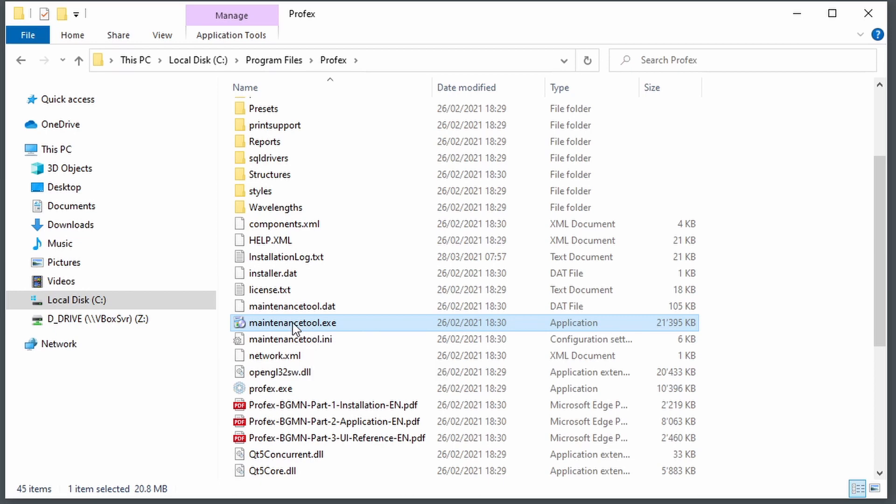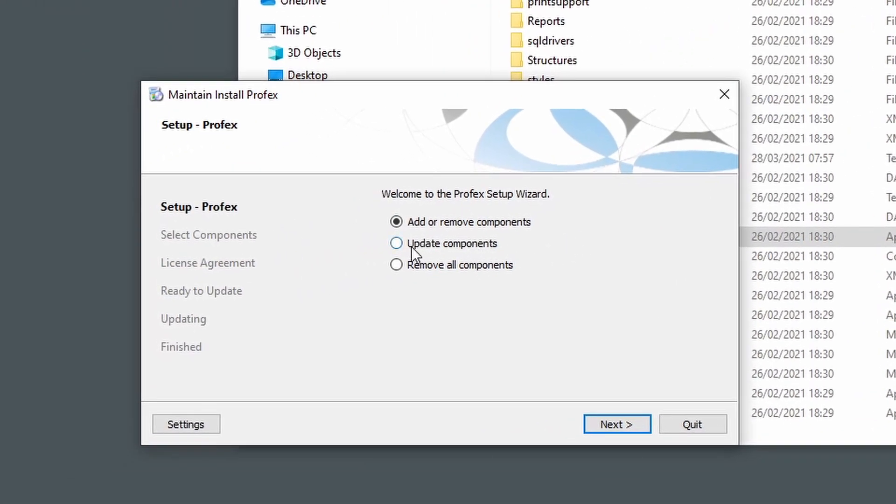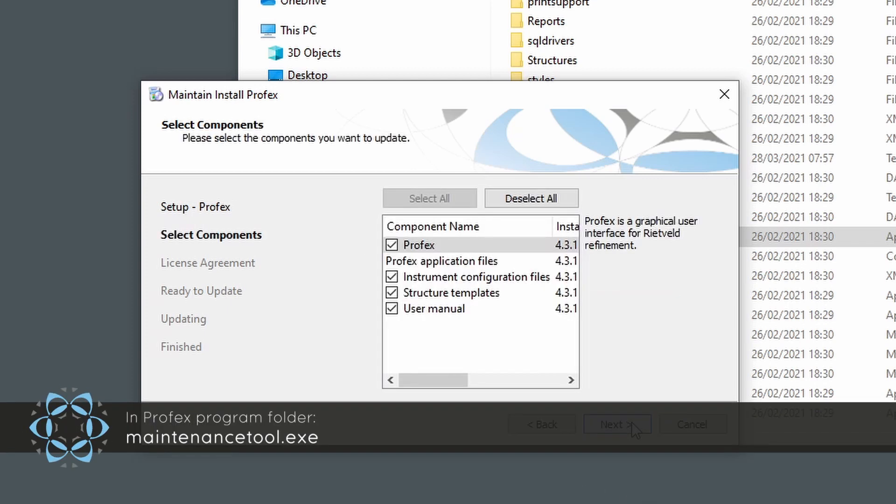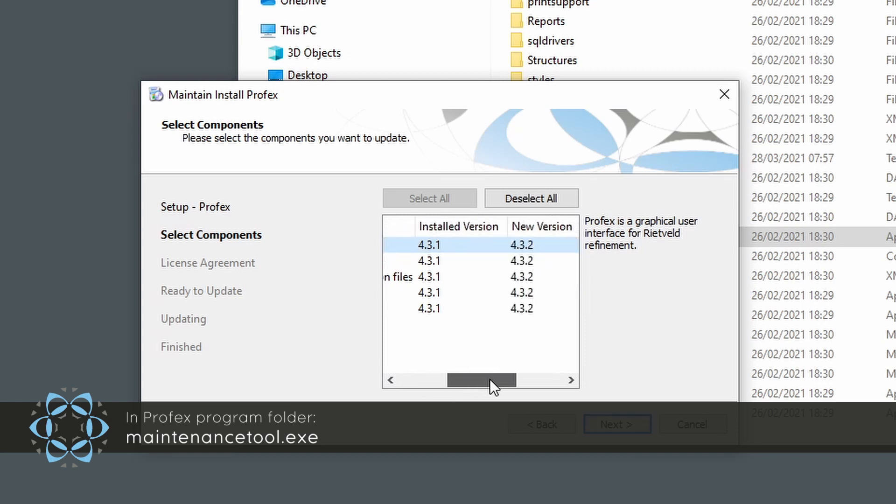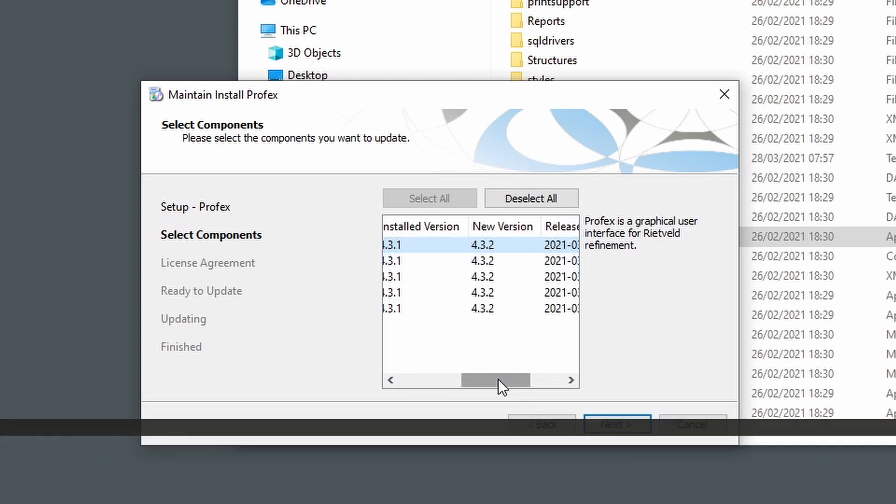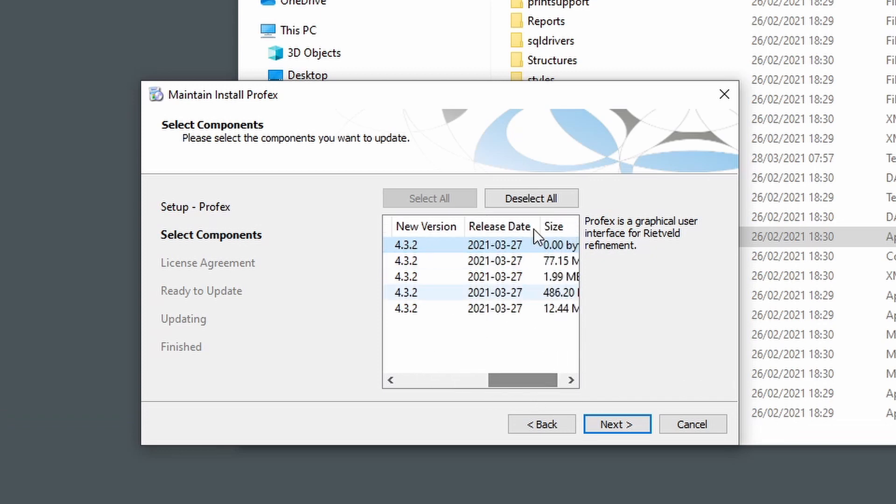We can run it, and then select the option Update Components, click Next, and now it will show us all the components for which a new version is available online. So installed version is 4.3.1 and the new version is 4.3.2, released on March 27.